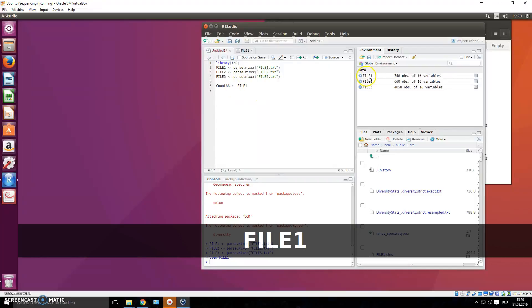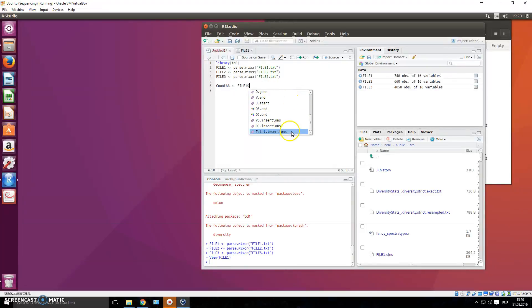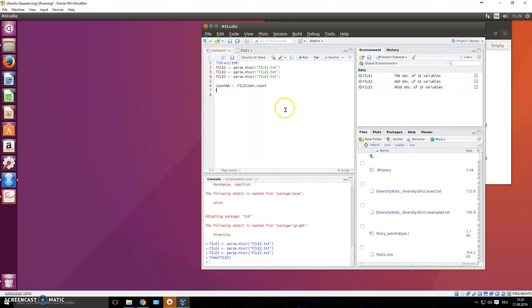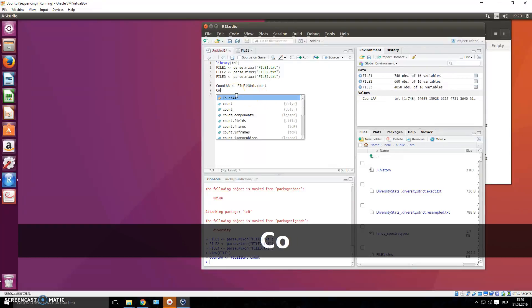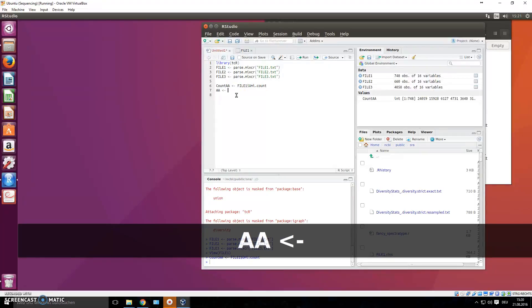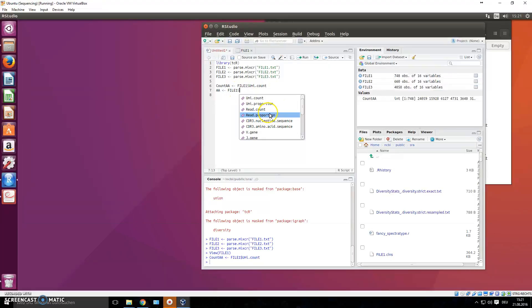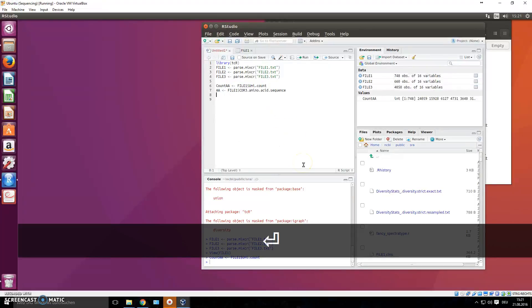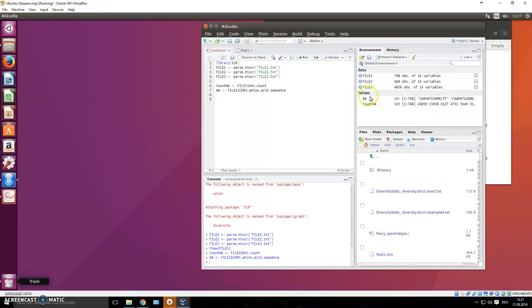We write file_one, calling this object from our global environment, then type a dollar sign - it already gives you a list of the different columns of that data frame. We choose umi.count and press Ctrl+Enter. Now you have a new list with all the information from that column. Then do the same for the AA sequence: type file_one, dollar sign, and choose the CDR3 amino acid sequence column.